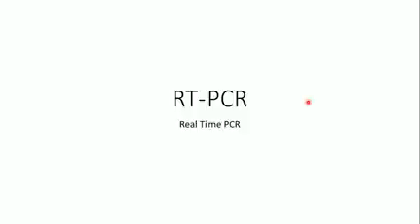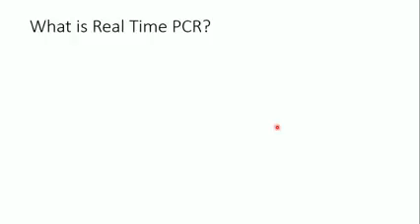Now in this video I'm going to speak about real-time PCR, the principle, the technique, how does it go, and everything related. I also will speak about reverse transcription because it's used widely in real-time PCR, and also the data of real-time PCR. So let's, as usual, start by asking what is real-time PCR. Real-time PCR is basically a modified technique from PCR.